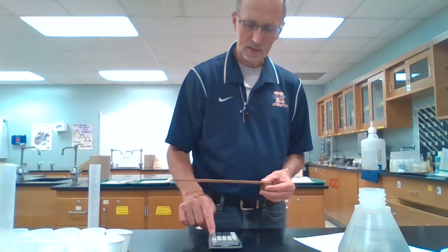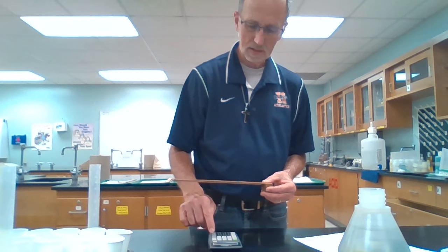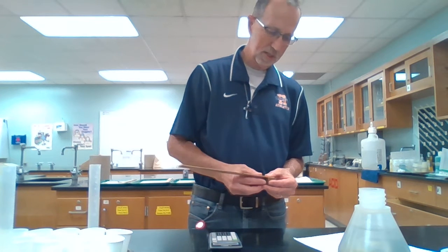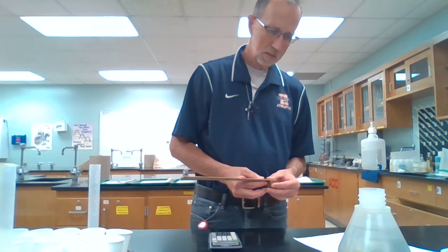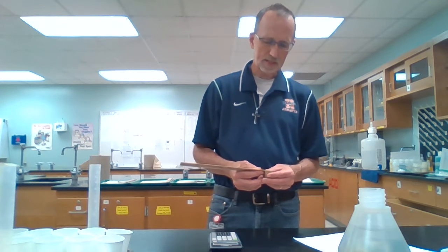Let me do a quick length times width times height again. Puts this right close to around 16.0. Of course, since I rounded to 2 decimal places, it gives me 3 sig figs. And when you're multiplying, of course, we round to 3. So based on this, let's put 16.0 centimeters cubed for its volume.